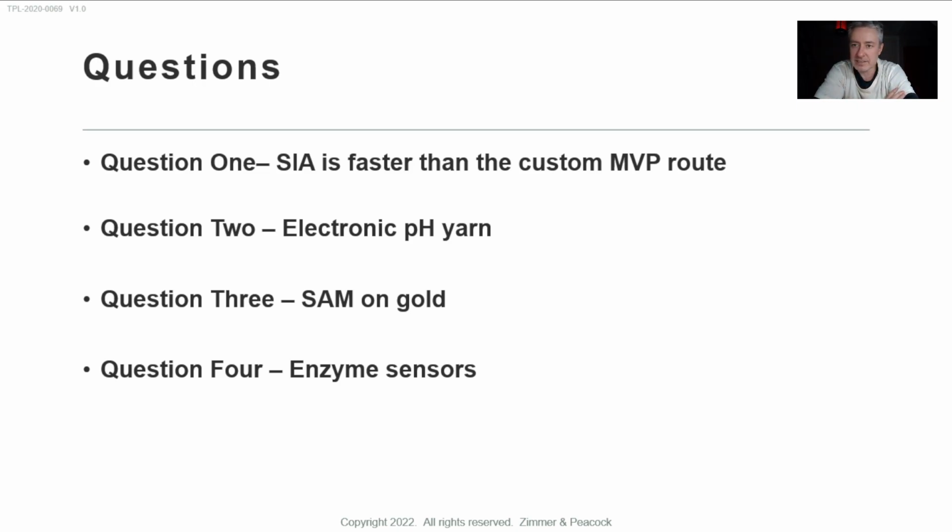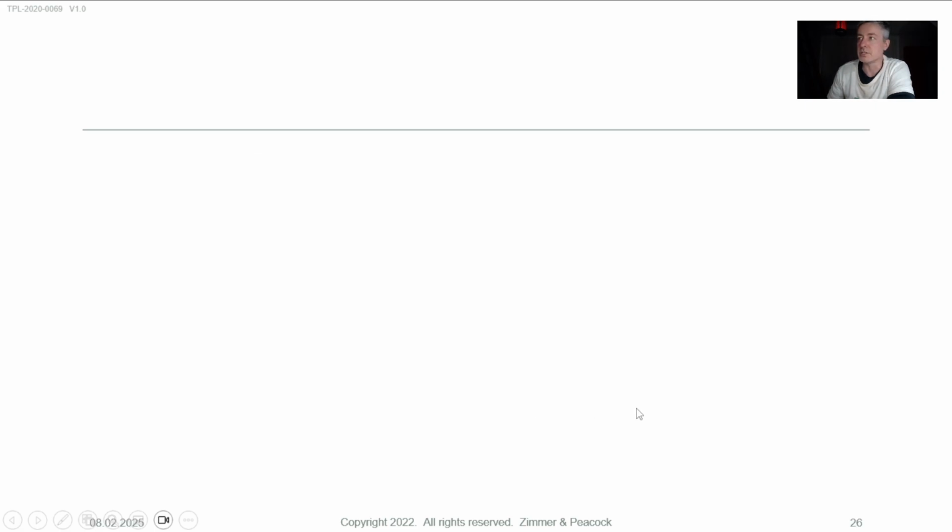Drop cast that enzyme layer using a lactate oxidase formulation that you found, and then use the concept of barrier layers. ZP has a polyurethane barrier layer on our website, but barrier layers are something you should definitely look into. Otherwise your enzyme has a kind of low activity and you say, oh, it saturates very early. Well, if you put a barrier layer on it, then you can extend the range. You'll lose signal, but you'll extend concentration range.